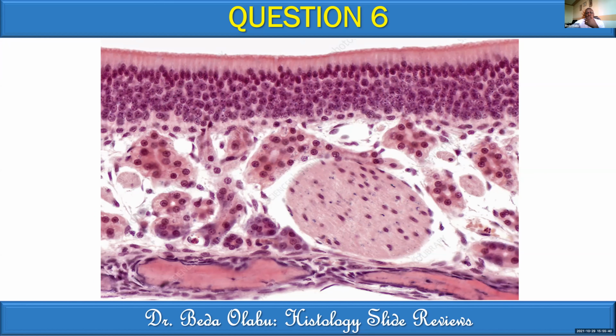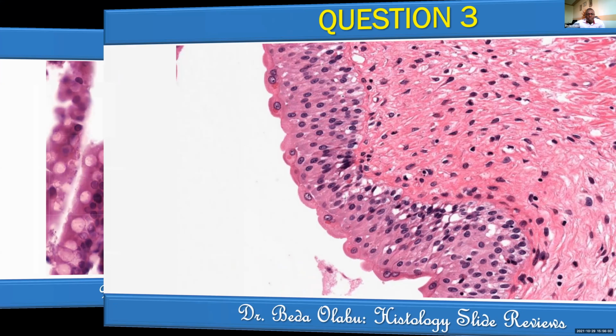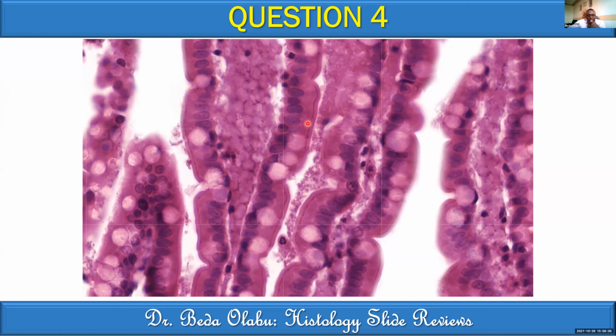Okay, good question. Now this one is not a good one for cilia, I agree with you, but I'll still not call it microvilli. Microvilli, you see 2 parallel lines, like a tram track appearance. Let me show you that shortly. This is microvilli: 2 parallel lines, very discrete, very uniform, compact together. That's microvilli.